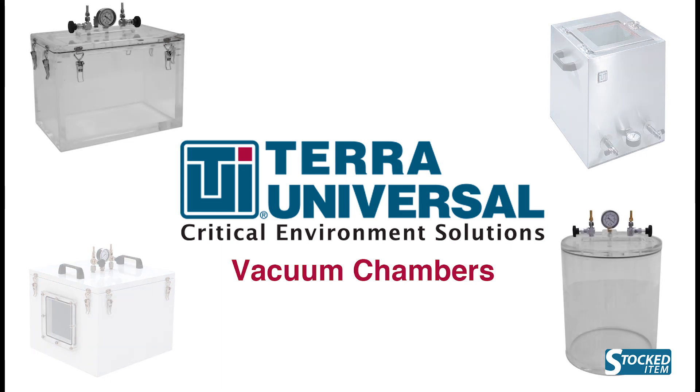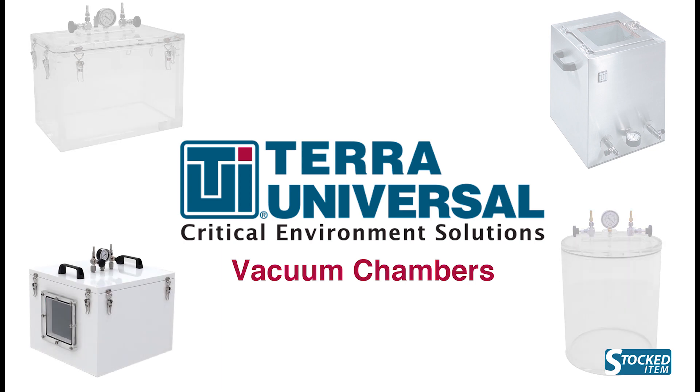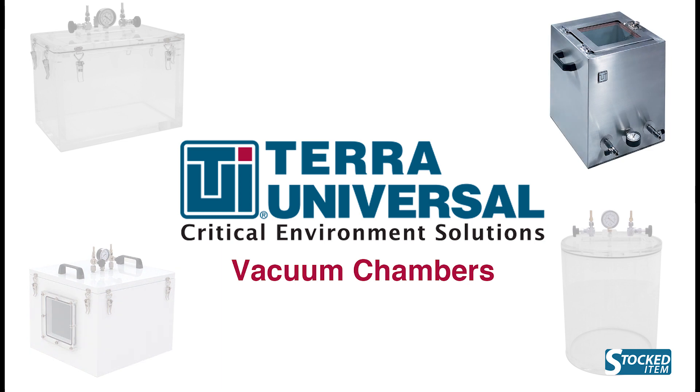Clear acrylic has the best visibility and lowest cost of the three types. Powder-coated aluminum features welded edges for less permeability and greater resistance to chemicals than acrylic. Stainless steel is resistant to corrosion and chemicals and has superior welded edges for minimal permeability.